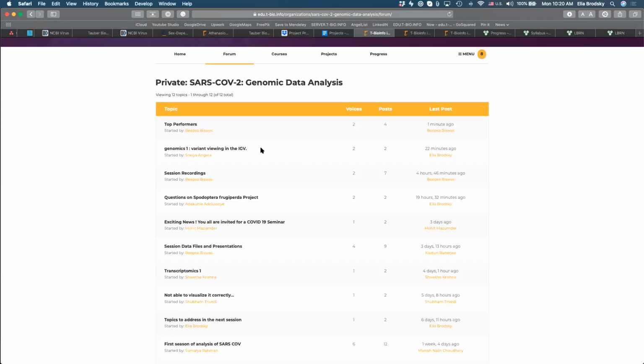And the question was, after you do Genomics 1, there's an analysis of some genomic data, and you have to visualize mutations, and you can visualize those mutations in Integrated Genome Viewer. So how exactly to visualize those variants? So please, I'm waiting for your response there.